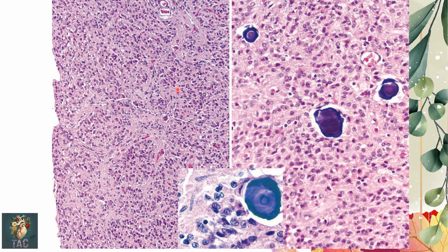So here you can see these slides of the pineal gland at low magnification and here at high magnification. The main type of cells present in this slide are the pinealocytes. In addition to pinealocytes, 5% of the population are glial cells, and also you can see these are the corpora arenacea, also called the brain sand. This is the higher magnification of this calcified area. Also here you can see the pinealocytes and the small amount of glial cells which are present over here.